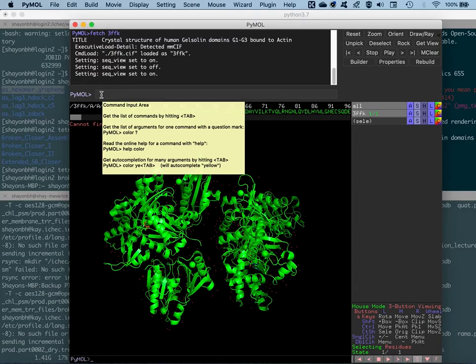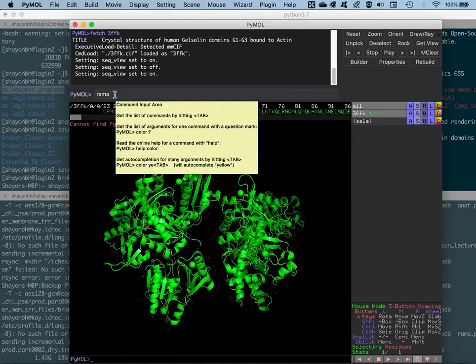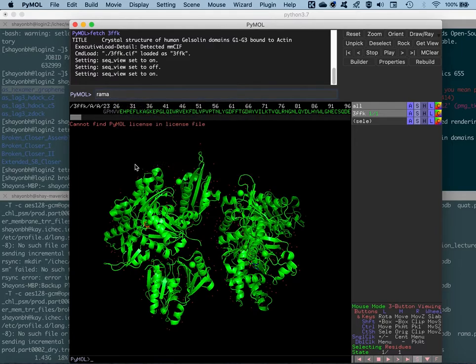Here we'll use a different command called rama, which is activated via the new plugin that we just installed, the DynoPlot plugin. First we'll do a generic plot of all these residues represented in green here. Then we go on and make a chain-wise plot. And finally, we do a secondary structure-wise plot with the specific helical regions, the beta sheet regions, and the turn or loop regions.